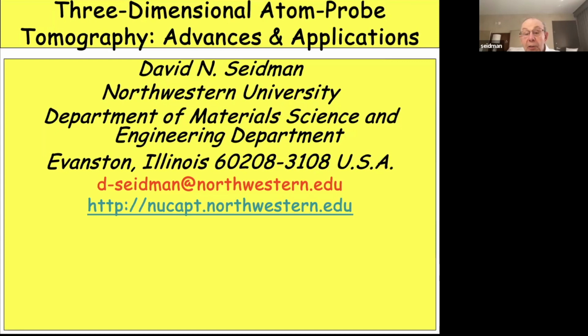Okay, thank you very much. The abstract is 50% correct. The 50% that's correct is to explain to you first what is an atom probe tomograph and why it's useful to look at things on an atomic scale. The second half, I had picked two examples that I thought may be of interest. One is about a meteorite, the Allende meteorite, which weighed about 2 tons when it hit the Earth. So it's like a big car.